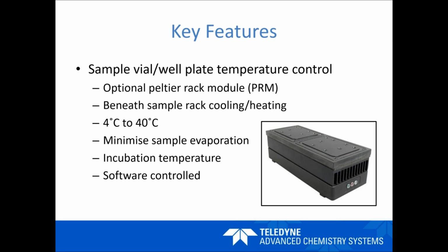So if you've got samples which might be more viscous, or where certain physical properties of the sample need some heat to keep the solutions moving, to keep them in the kind of viscosity that you want, you might look to raise the temperature there. There's also the idea of using it as essentially incubation temperature for something like cell analysis, and all of that is software controlled, either in the ICP operating software or in our own software to run it.